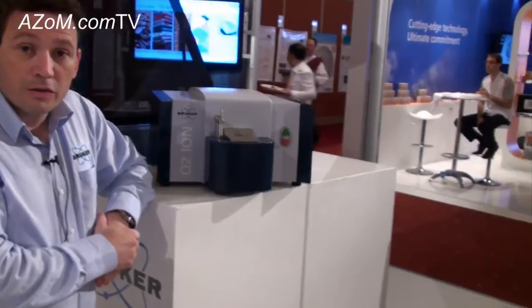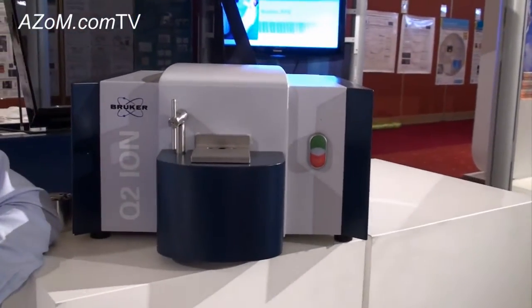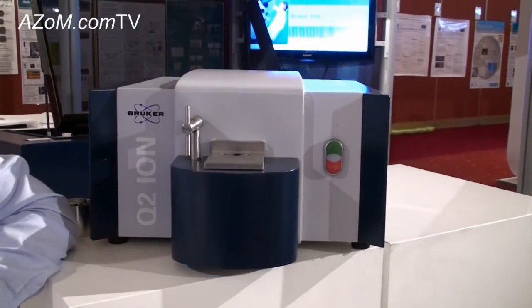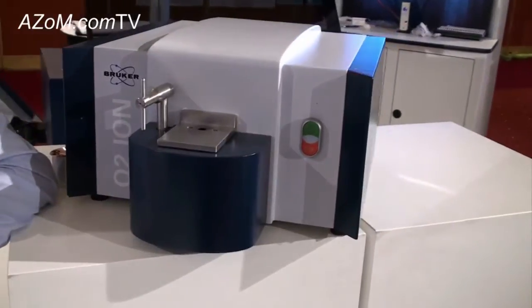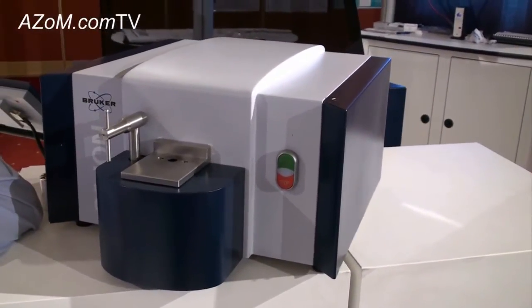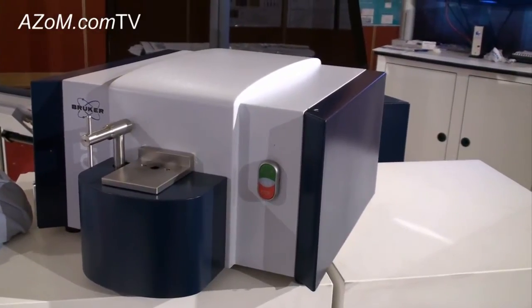This is our new Optical Emission Spectrometer. Brooker have quite a comprehensive range of ArcSpark Optical Emission Spectrometers for use predominantly in the foundry industry. This is our entry-level instrument — the Q2 Ion Benchtop CCD-based ArcSpark Spectrometer. It is marketed to small foundries and metal recyclers who want to classify their scrap metal to easily know what type of grade material they have.